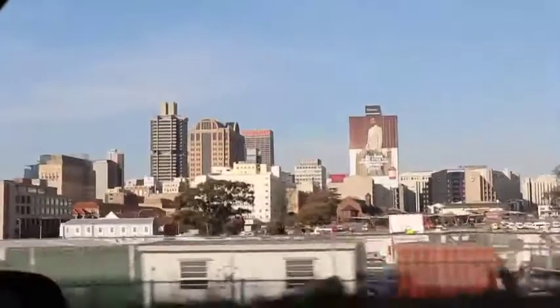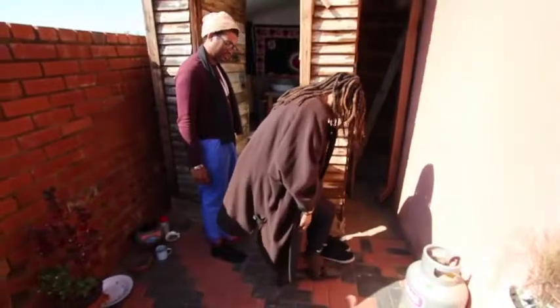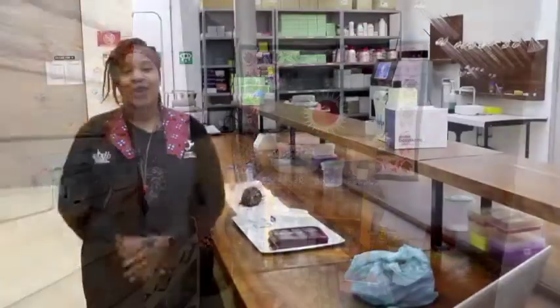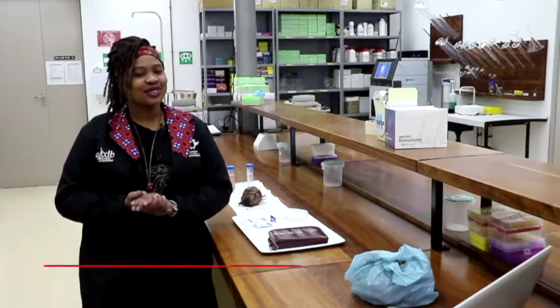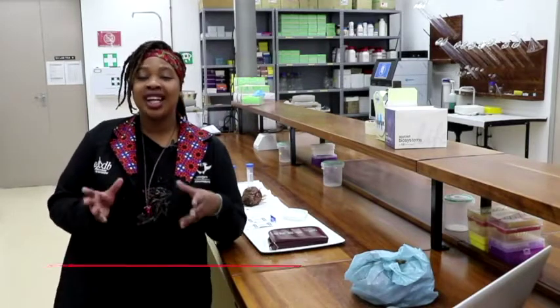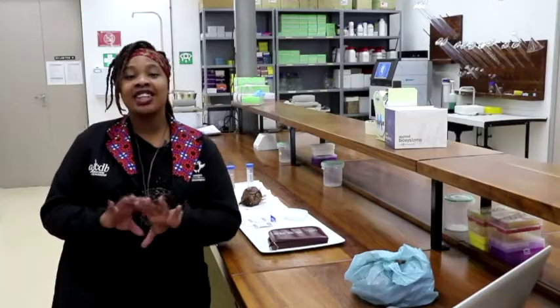Join us as we unravel the mystery behind MOTI. Welcome to the wonderful world of DNA barcoding. To simply explain what DNA barcoding is, it's a relatively new science that uses a short gene sequence on a standard genome to actually identify species.